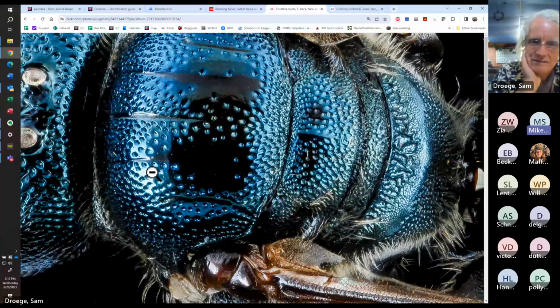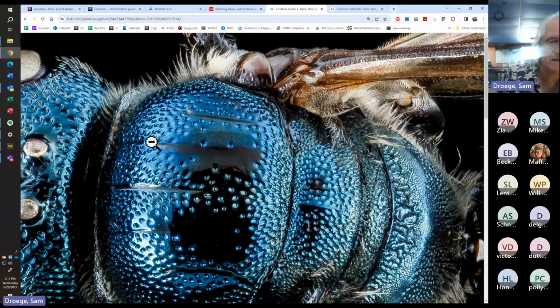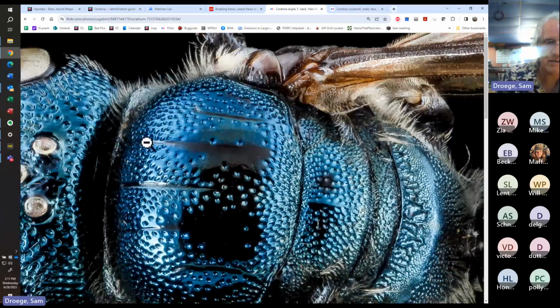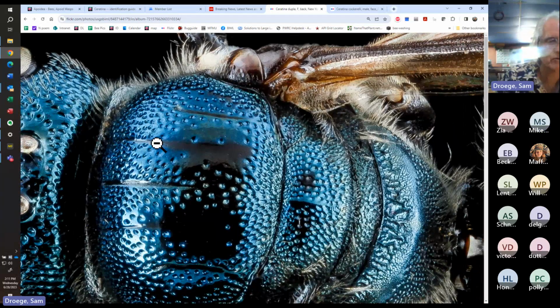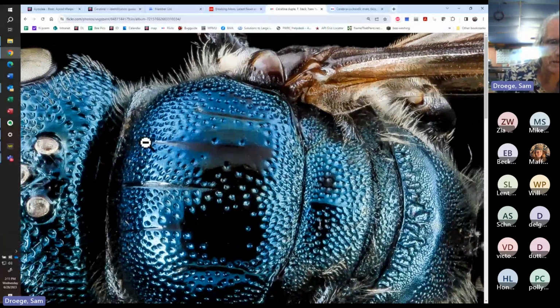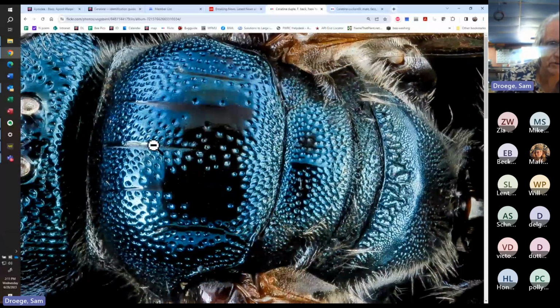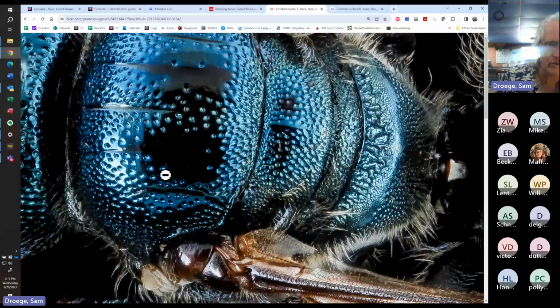It was really obvious on that picture, and then I started pulling specimens. I'm going to have to look at all the species I have specimens for and see what those lines do. In general, it would be interesting to look at those, because a lot of times this is how you find new characters and see whether there's differences among species. I'm just completely unaware of this phenomenon. So now I have to look at other species groups. Is it just Ceratina that has this? And also, you can see that they basically peter out at the edge of the anterior set of pits. And mostly we're looking to the posterior of that in terms of characters.